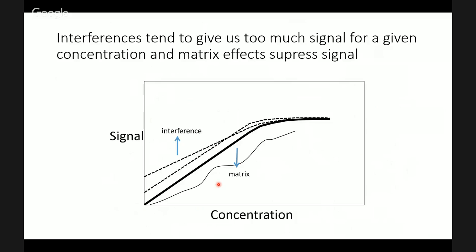So kind of to summarize some of the things that we have to do to correct our data. Ideally, we'd make some kind of concentration calibration where we produce a calibration curve that looks something like this, where we know the concentration of some standards, and then we can measure unknowns for their signal, and then use that to work out what the concentration is. But there are problems with that if we have interfering elements, so things that add to the signal from different elements, or molecular interference, or these double charge interferences. For any one concentration, we'll end up with more signal than we should have.